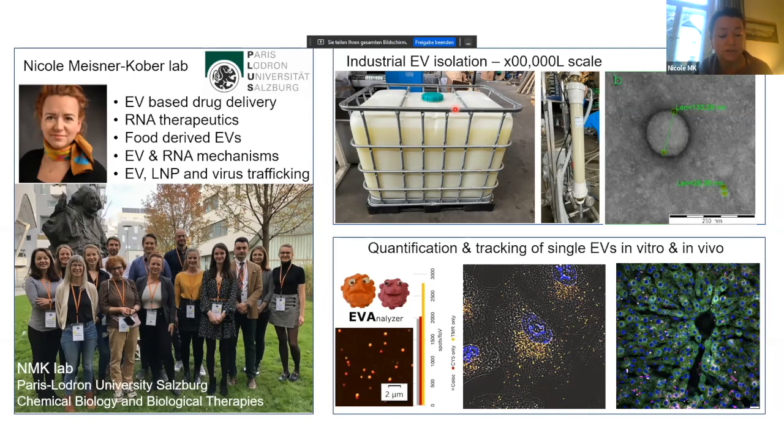We have a particular interest in food-derived EVs and oral applications. And along that, obviously, in a lot of the work that we're doing, we're interested to not only quantify and characterize EVs at the single vesicle level, but also track them in different models such as cells, but also tissue, ideally at the single cell, single vesicle level.